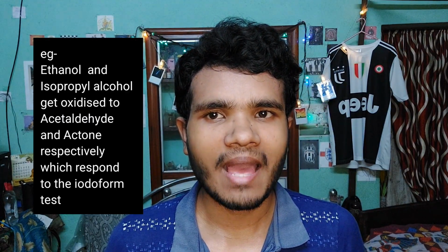This video is about a classical organic reaction called the iodoform reaction. This reaction may be used to identify compounds having a ketomethyl group, or compounds which may easily be converted to compounds having ketomethyl groups. These are the useful timestamps.